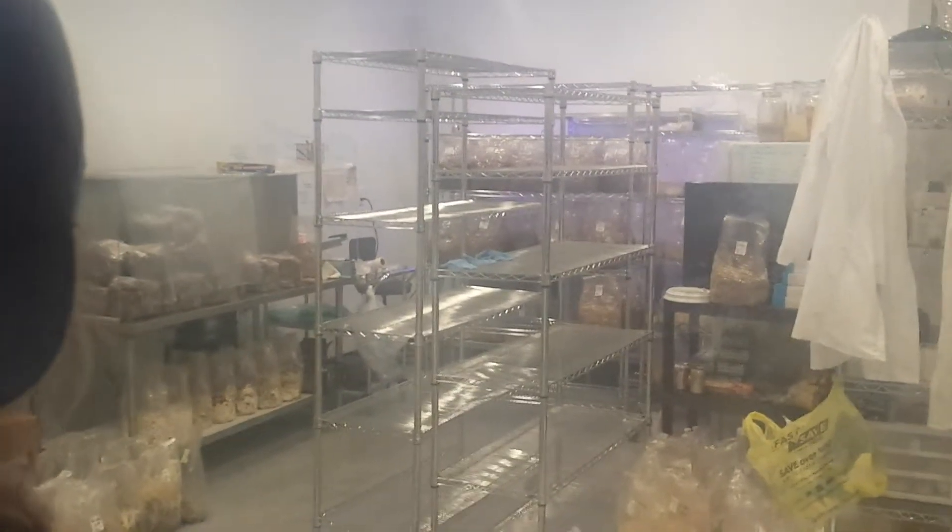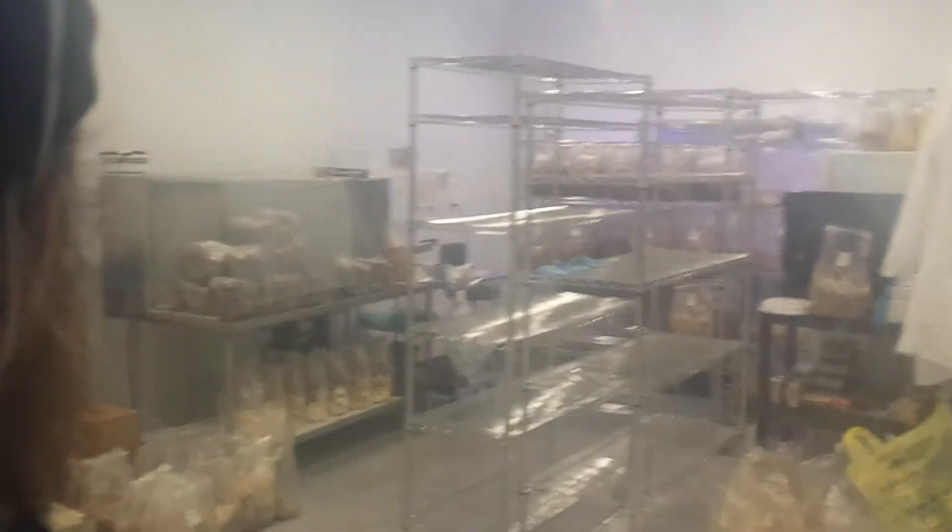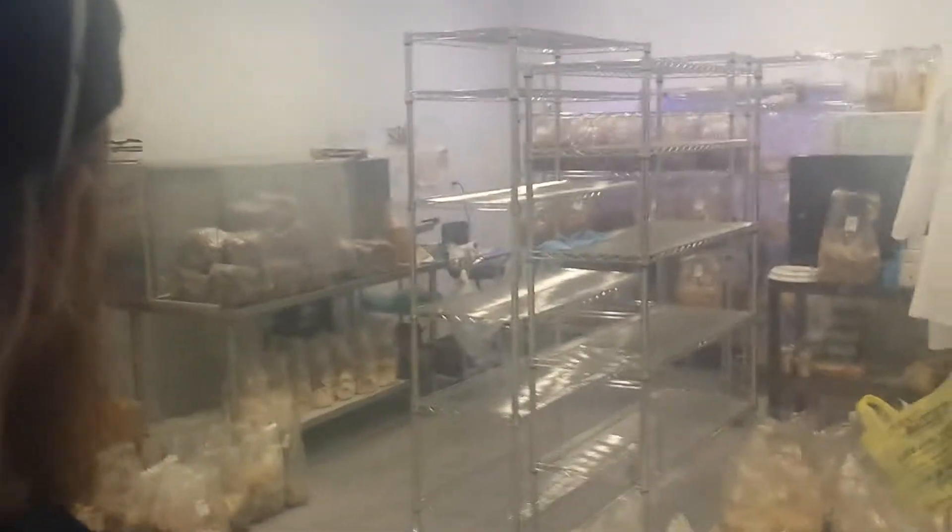Completely sterile air. It's really pure. So I culture in front of those hoods. I've got pastry plates — you might see some vials and everything. Those are for bacteria.